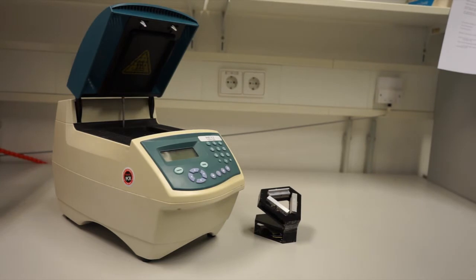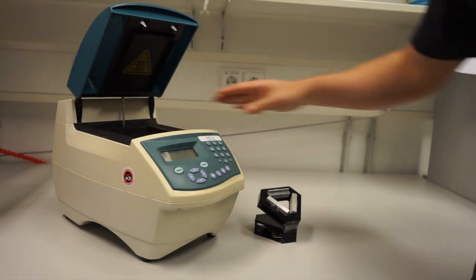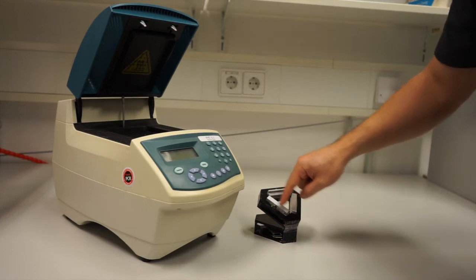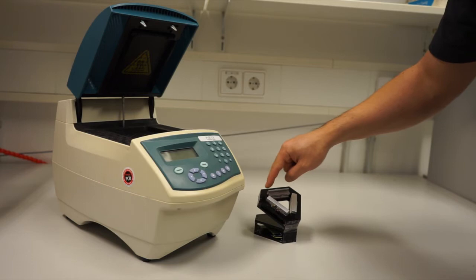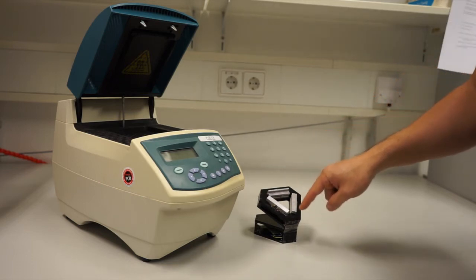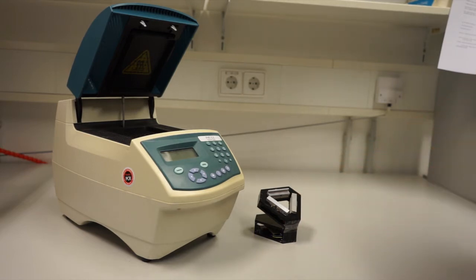And this is the Polymerase chain reactor. Now the innovation is, instead of having this expensive and huge heating and cooling elements, we just have 3 PID-controlled heaters. The first stage is our denaturation at about 95 degrees. The second is our annealing at about 55 to 65 degrees. And the final is our elongation zone, where our DNA is actually copied, and that happens at about 72 degrees.